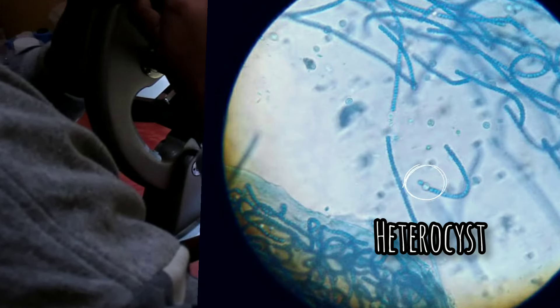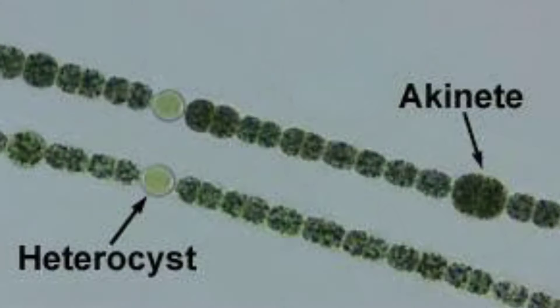Besides the formation of heterocysts, the filaments occasionally form akinetes which are not found in this slide, but I have collected some microscopic images of akinetes of Nostoc from internet. Akinetes are oblong or spherical and are much larger than the vegetative cells. They are formed centrifugally in series between two successive heterocysts. Under favorable conditions, each akinete develops into a new filament.